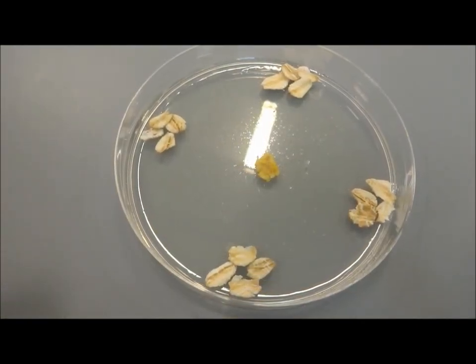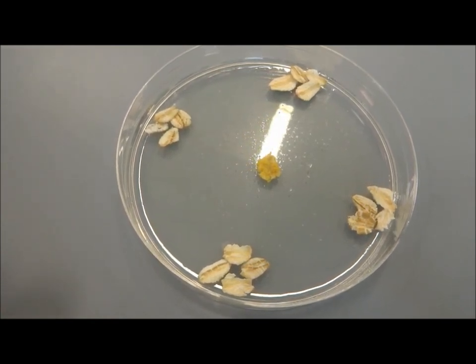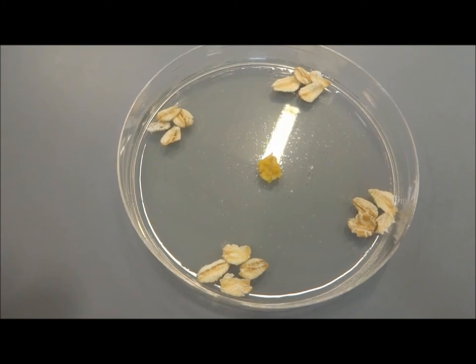In this example shown, the piece of slime mould is placed at the centre of the plate so that it can migrate outwards towards the food sources.